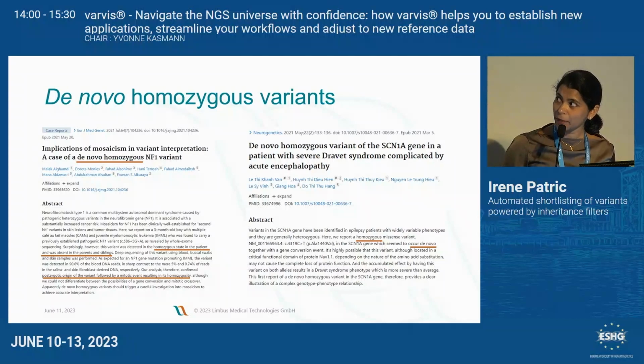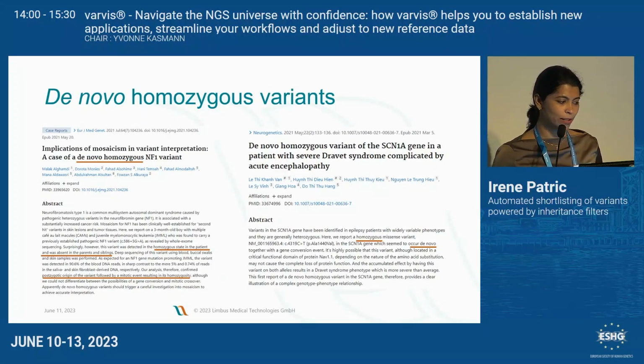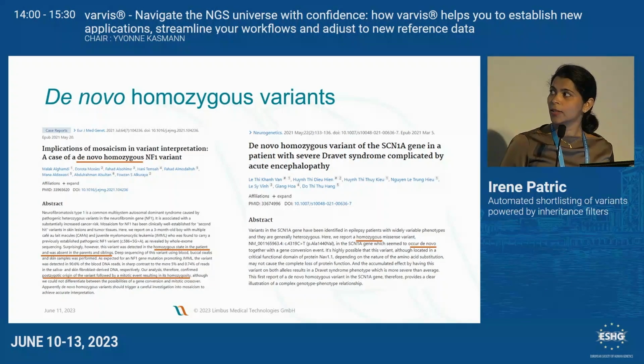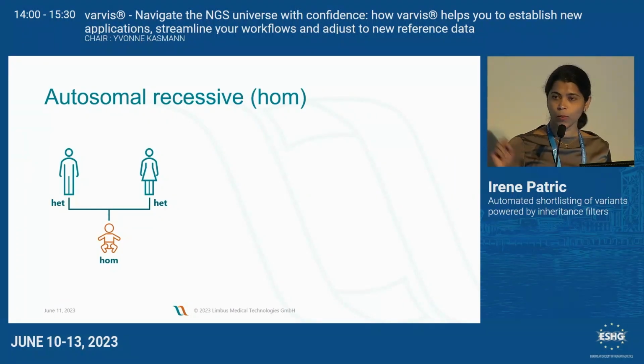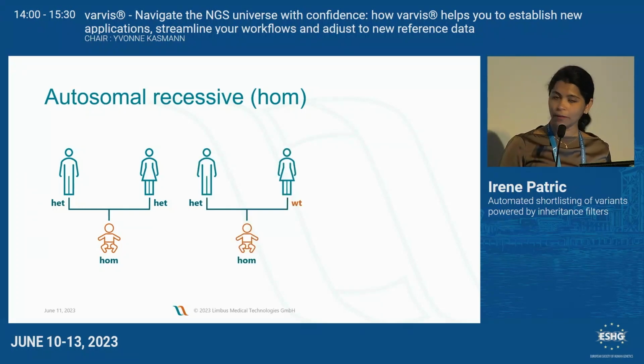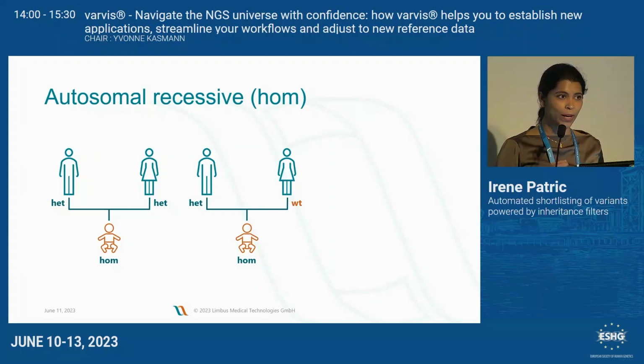We are still missing something when it comes to de novo, which is de novo homozygous variants. So I will say why here. Several tools work like this, where an affected individual is homozygous and the parents must be heterozygous each. But would this scenario be covered by the filter when one of the parents is only mosaic and not really detected by WES?